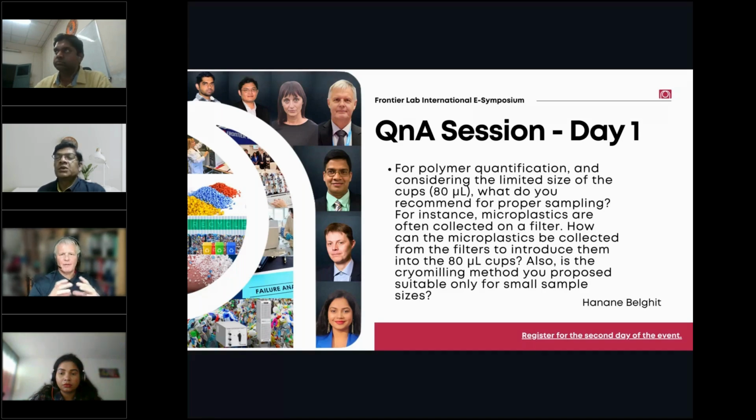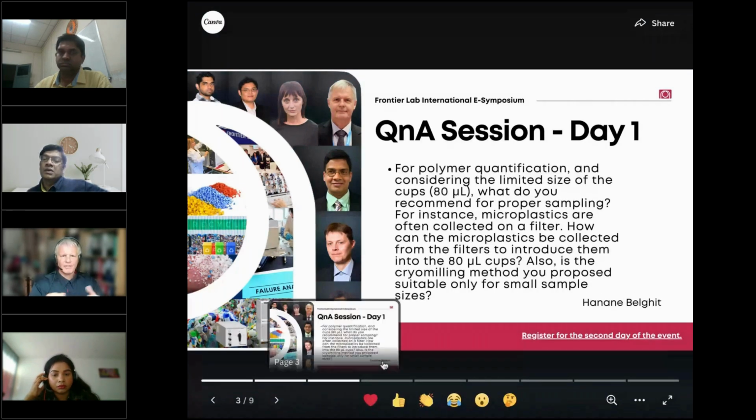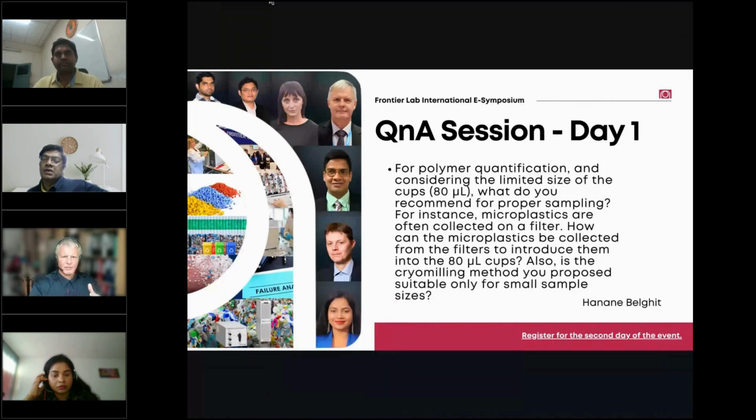That is also an advantage if you have bigger filters like 4 centimeters, that you can cut it in sections and then filter these sections separately and put the whole thing together. Of course, then there is always a small risk of losing information, losing some material and so on. But that is a second approach that you can do.